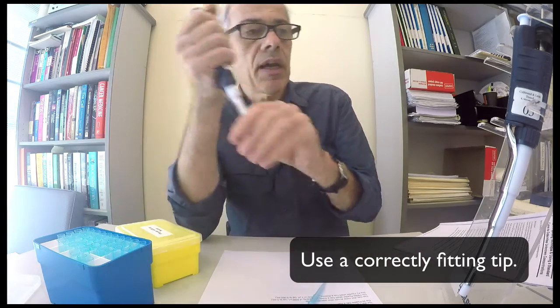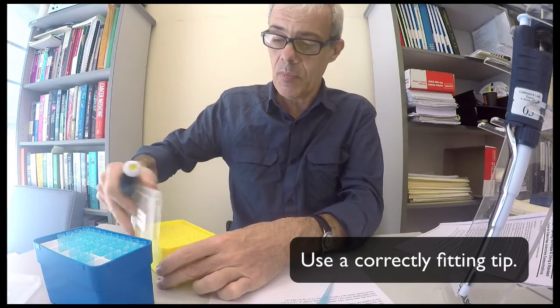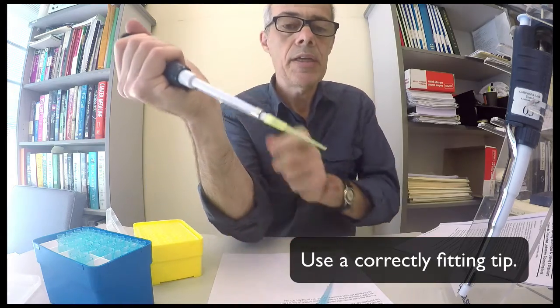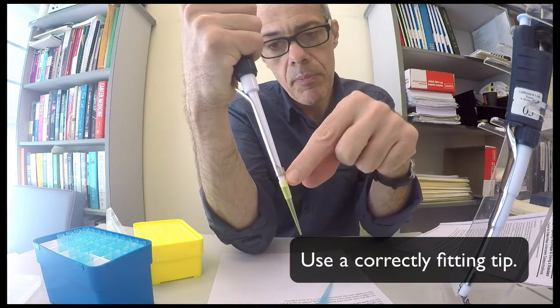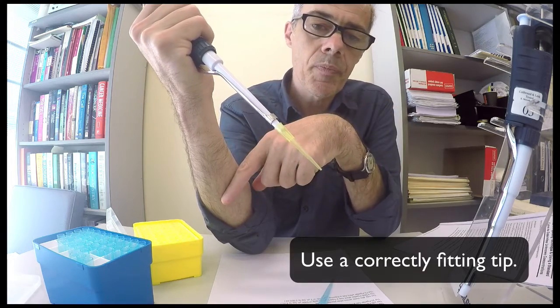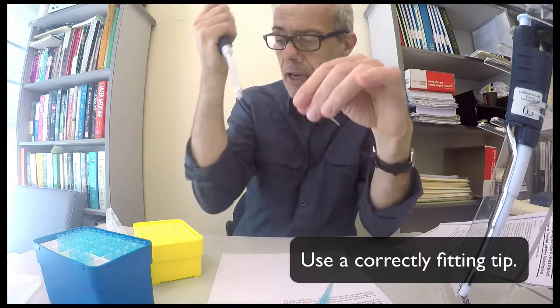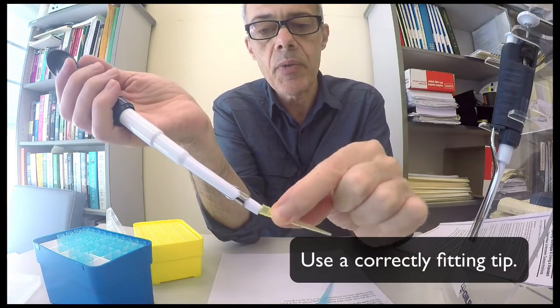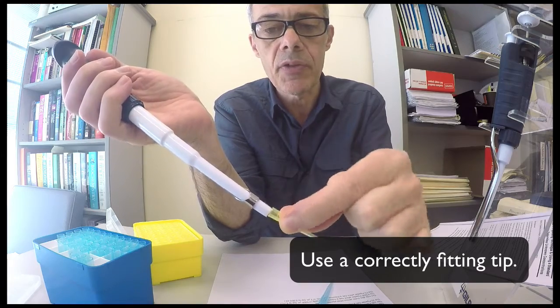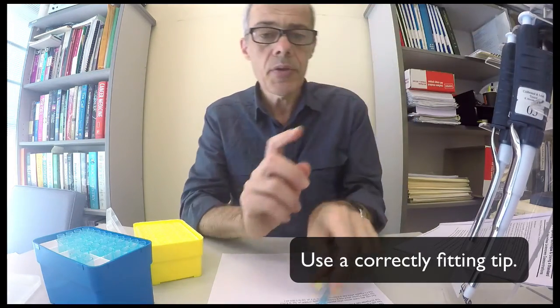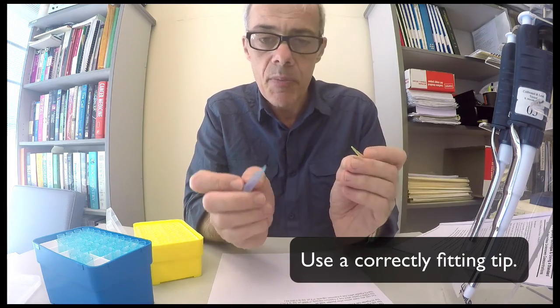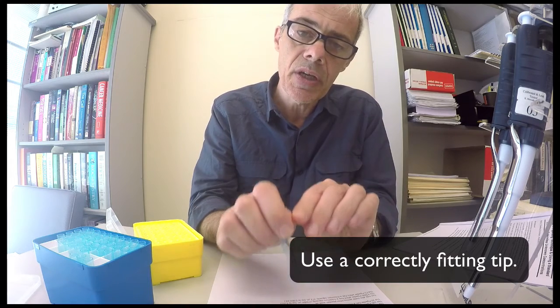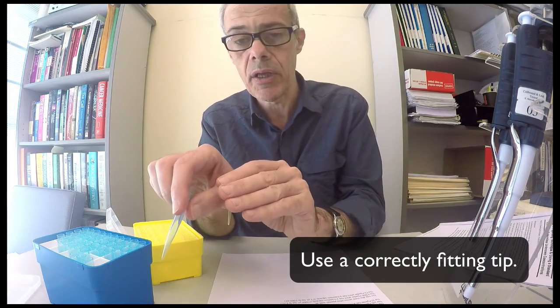And likewise the P200 perfectly fits these yellow tips. The yellow tip doesn't fit anywhere close to the P1000. So when you use these pipettes you only ever use them when the tip is attached, and it's only the tip that you're going to immerse into the solution that you're going to transfer from one container to another container.